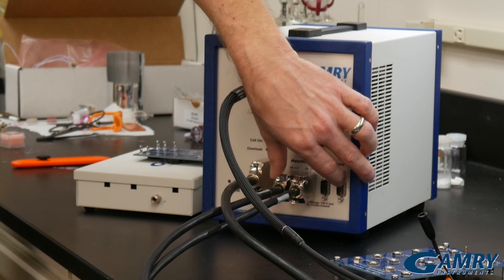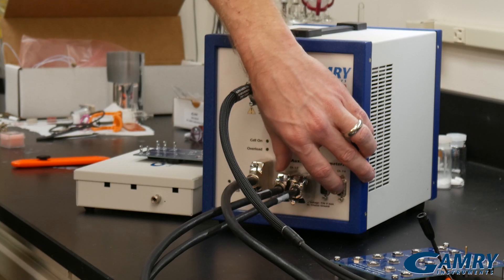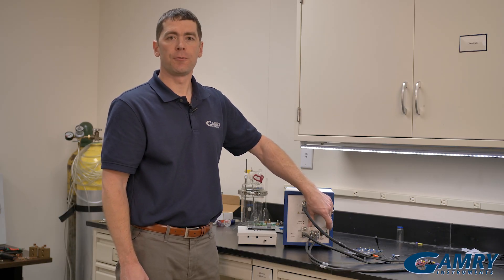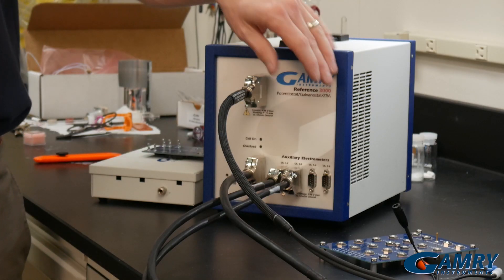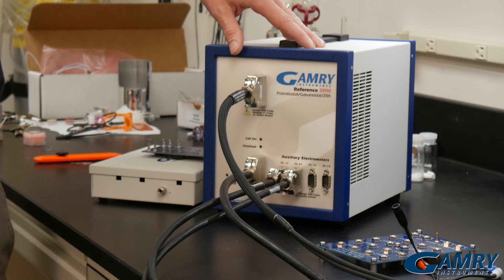This particular instrument has eight additional voltage measurement channels that we can calibrate here. These additional voltage measurement channels can be useful for measuring multiple cells within a stack. They can be used for measuring multiple reference electrodes so you can see a voltage drop across solution. They can also be used for measuring other devices such as a pH meter or a pressure gauge. But these extra channels have to be calibrated the same way the main channel has to be calibrated.